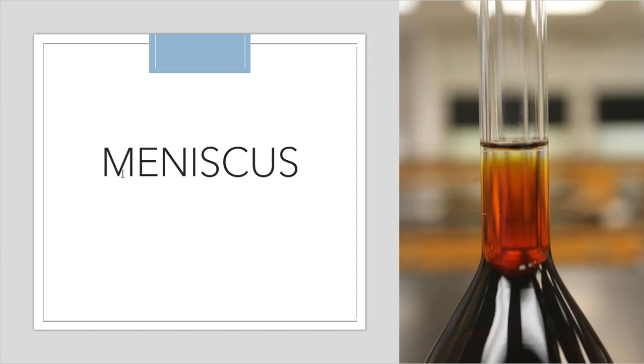So if you look, I've topped this off with acetic, but you see how the top layer here is kind of clear compared to the rest of it? This means that I need to mix it. So I'm going to put a cap on it, and I'm going to invert and mix this volumetric a couple of times. Typically, they say 30, all right? 30 flips with a volumetric flask, and you can ensure that that stuff is mixed extremely well.